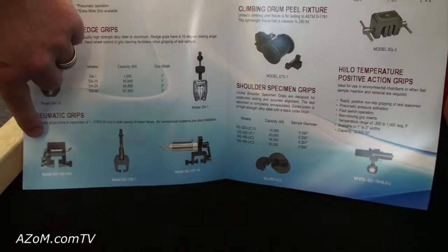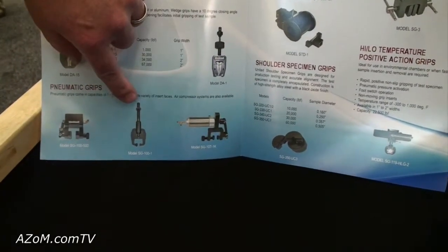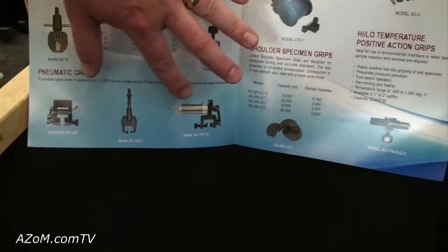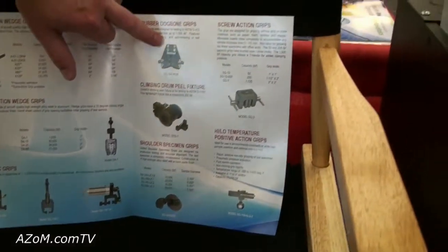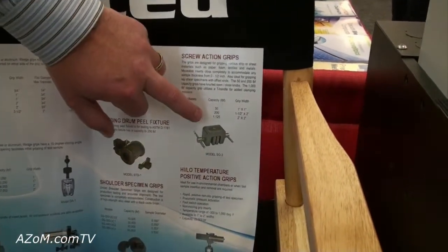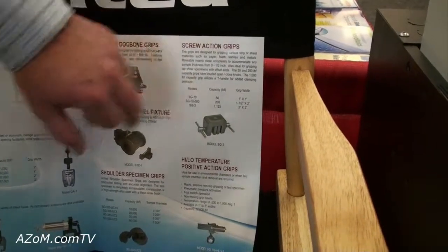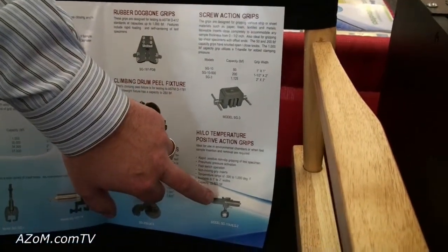We also offer pneumatic grips: 500 pound, 200 pound, 1000 pound. These are more set up for the D412 spec — the dog bone grip. This is like a vise-type grip, SG. Higher capacity air grip down here on the bottom.